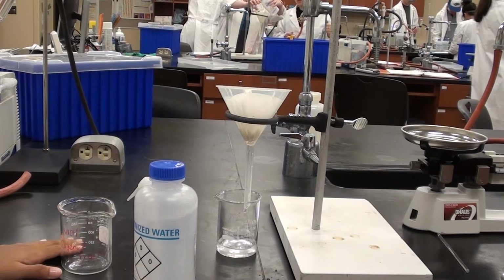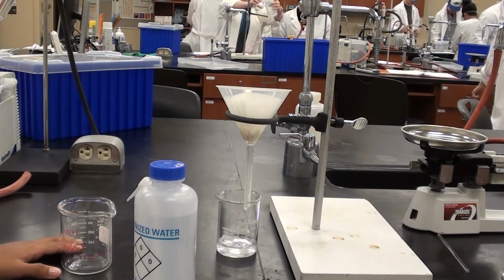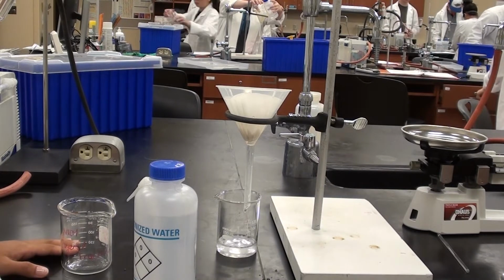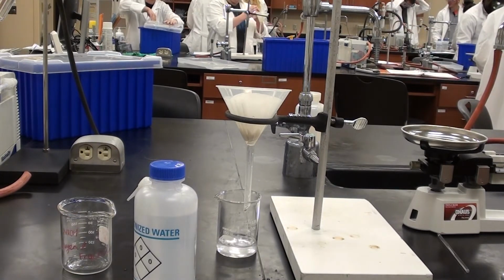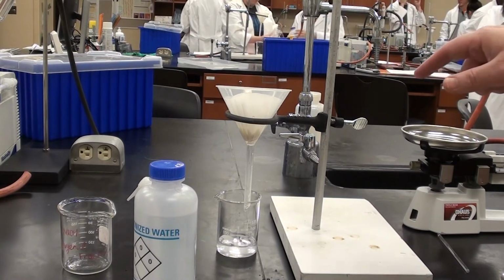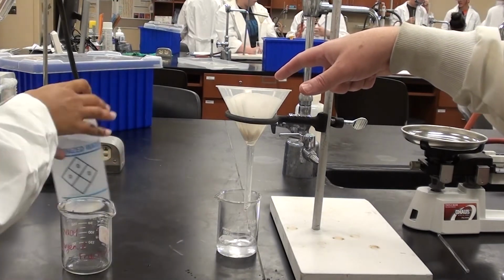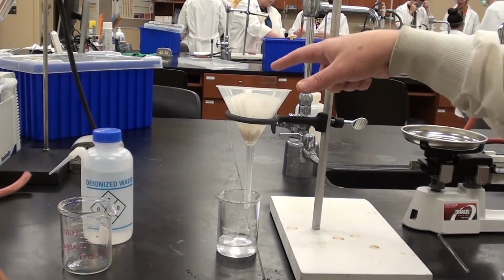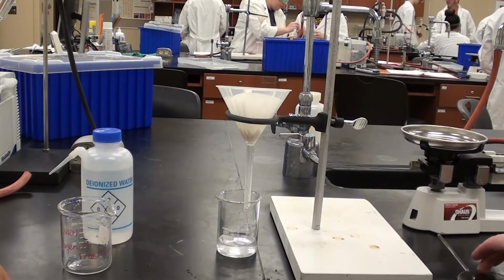Now just a note about the filter paper here, make sure it's fast filter paper. If it's slow, this is going to take forever. The fast should be good enough to get all the sand at least. And what she's going to do is wait for that so that there's no water on top of the sand over here. And once that's done, she'll take it off and put it onto her watch glass. And then we'll put it in the oven.